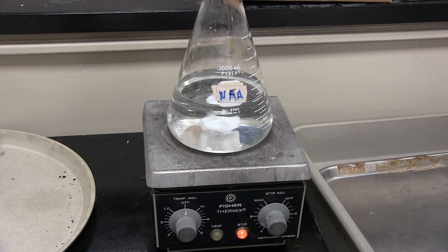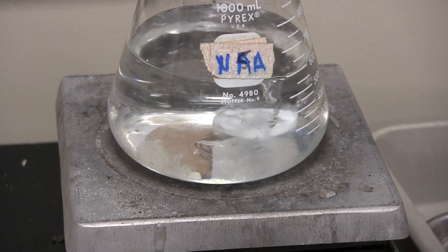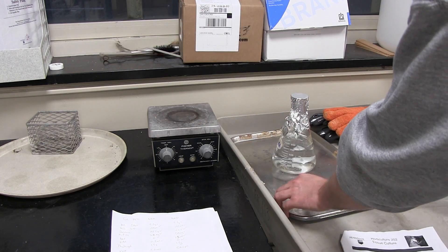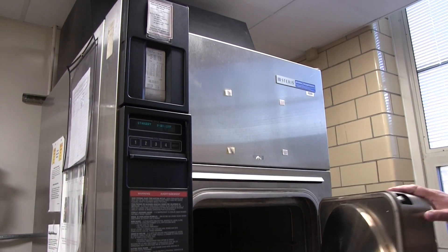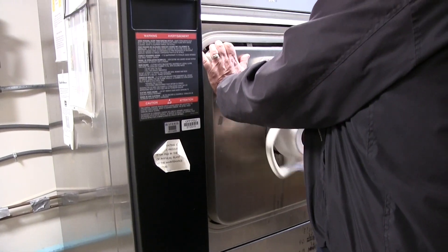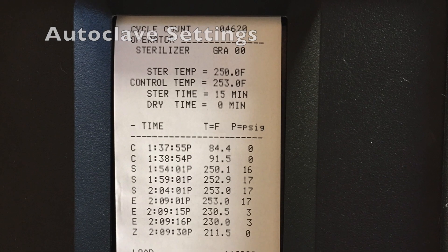Thoroughly mix ingredients in 500 milliliters of water. Once mixed, add water until 750 milliliters and mix again. Bring solution to autoclave, place inside, close and lock the door. Set autoclave to 250 degrees Fahrenheit and a sterilization time of 15 minutes. Once complete, let solution cool for 5 to 10 minutes and pour growing media into sterile petri dishes.